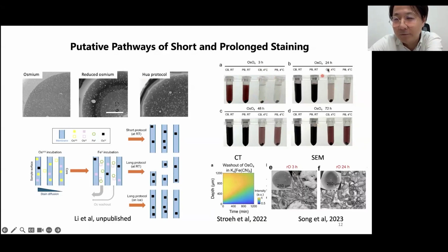But after 24 hours, or 2 days or even 3 days, you will see the test tube is completely black, and your sample slowly dissolves in this kind of buffer. But if you stay at a lower temperature, usually the sample will still be intact, and can be further processed in the next round of, for example, ferrocyanide or TCH amplification or some other steps.